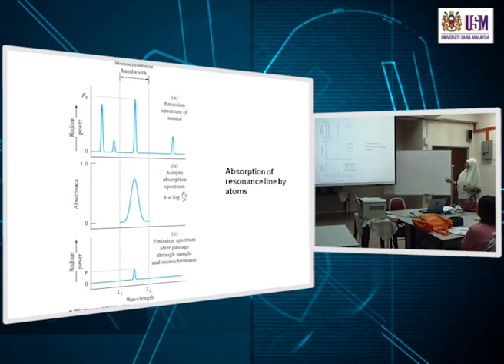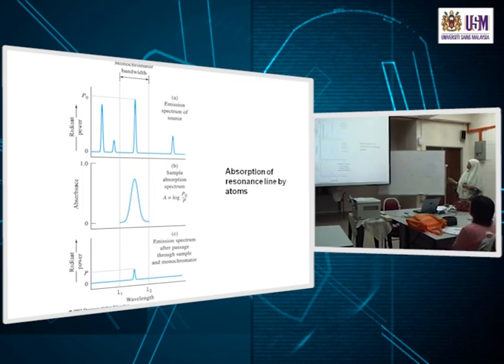And we have identified that we want to use one of the lines to measure the atomic absorption of copper. Usually we use the resonance line, 324 nanometers for copper. So we have set our monochromator to 324, and using a certain slit will give the monochromator bandwidth, which means that coming out of the monochromator will be this range of wavelengths. But because the line source is so thin, you only get, even though the monochromator will allow this fat band to come through.